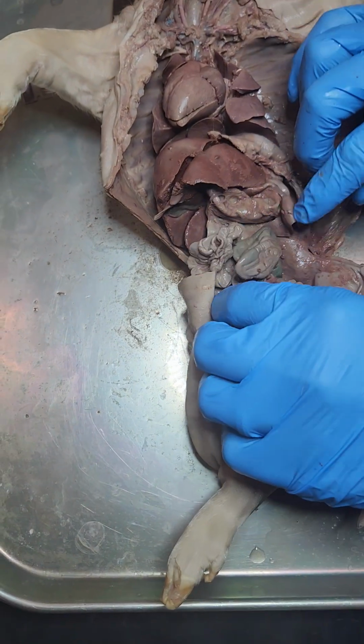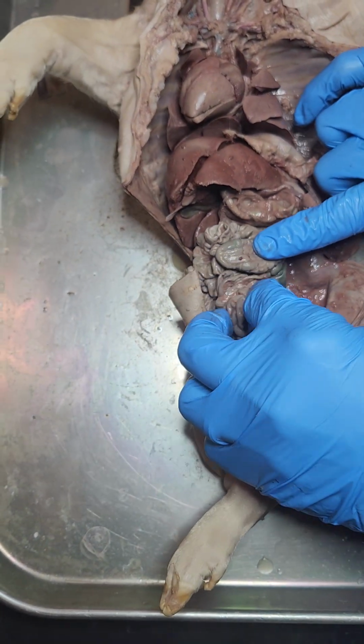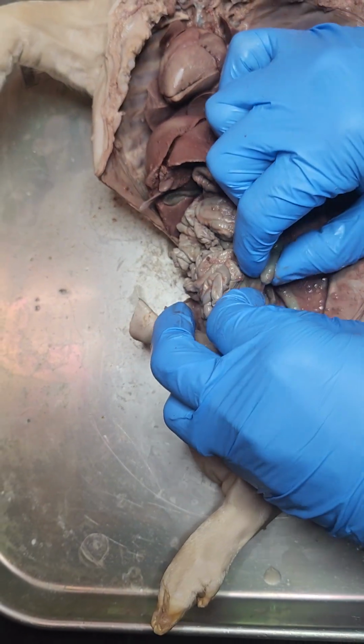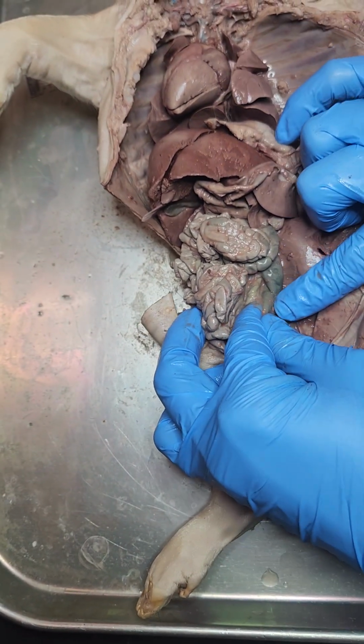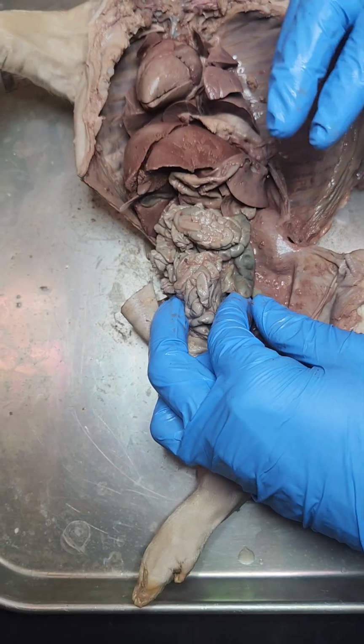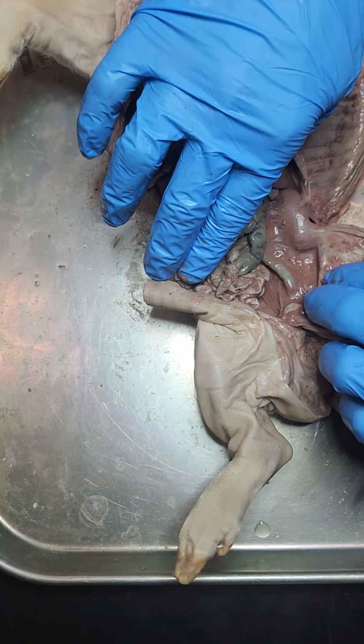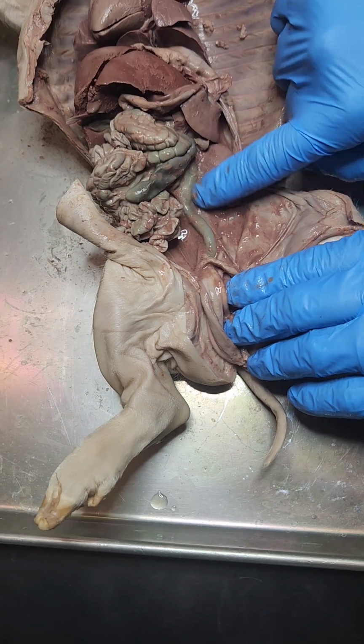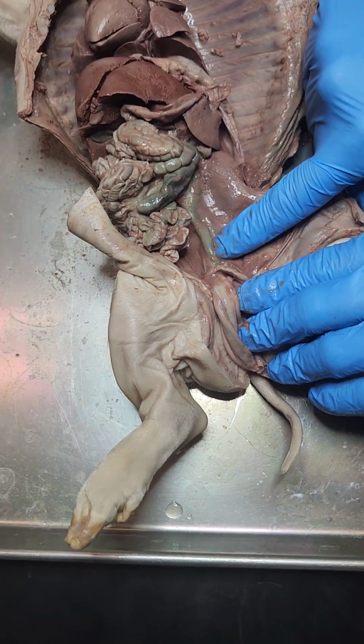Large intestine is this right here, okay? And then cecum is next. So cecum is a dead end. So when we find the large intestine, we can find this little pouch, it's a dead end, and that's the cecum, and that's for additional absorption. Colon, we find the large intestine, we follow it all the way back to where it starts to leave the body. That would be the colon right there.